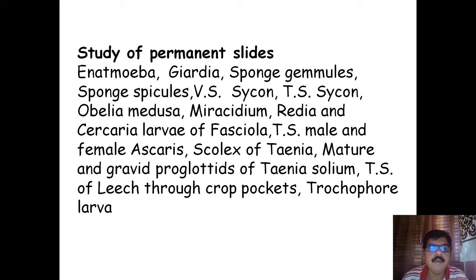Miracidium, Redia, Cercaria larva of Fasciola, T.S. of male and female Ascaris, Scolex of Taenia, mature and gravid proglottids of Taenia, T.S. of leech through crop region, and trochophore larva.